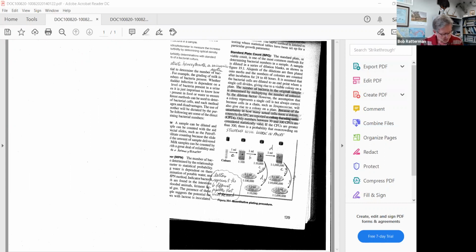And we use only 2 significant figures. They talked a little bit about if there was 227, we would round that up to 2.3 times 10 to the 8th. We wouldn't write 2.27, we'd write 2.3.